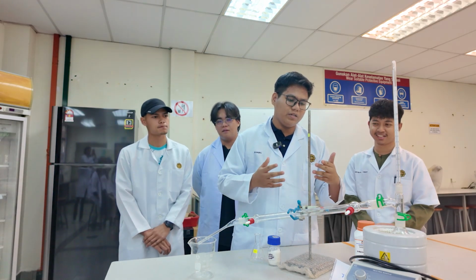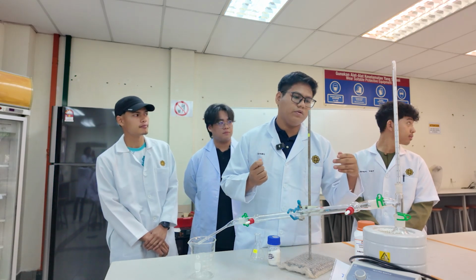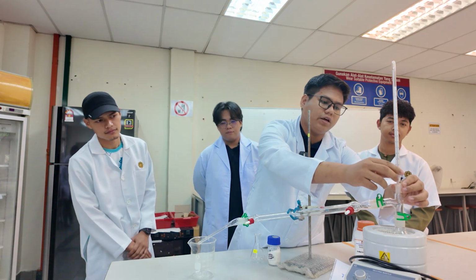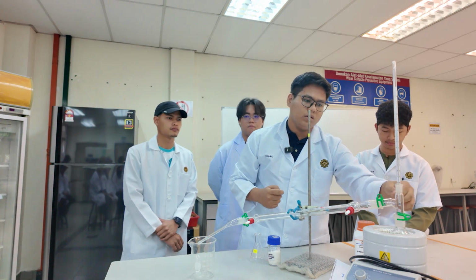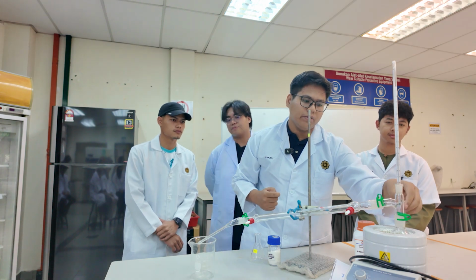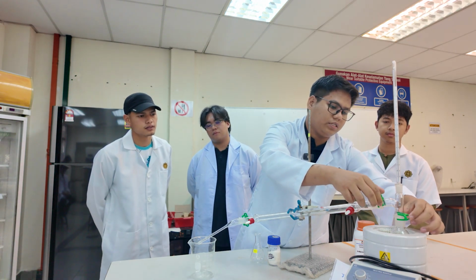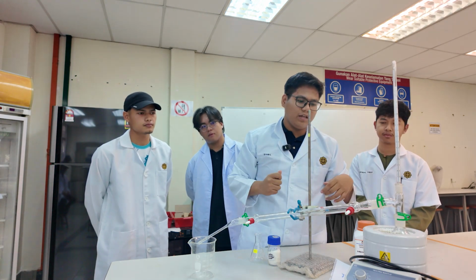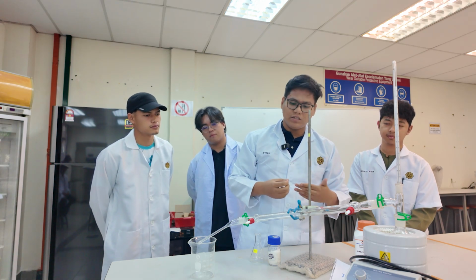Before we set up the apparatus, we need to make sure that the thermometer is tightly sealed, so that there is no gap and no vapor will come out from the distillation head. And also we need to apply this clip to avoid any of the apparatus from falling off, or even worse, breaking.